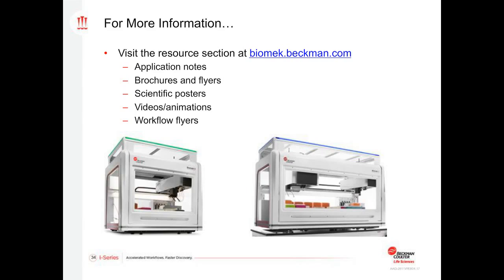Our first question is, have you successfully automated cell culture without the tilting out by optimizing pipetting? That's a great question, and again, it might depend on a given workflow. For example, the large one-well plates, as they're called, would potentially be a little trickier to work our way around, but the 6-well plate, we are able to aspirate around the circumference, and that would be just as effective a way of removing the media without disturbing the cells. It might just take a little longer to execute that process.